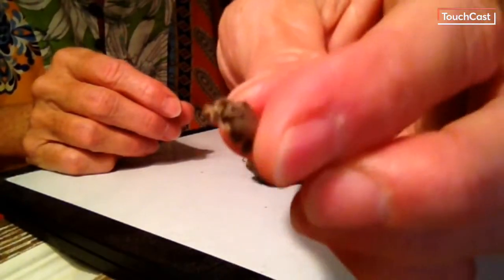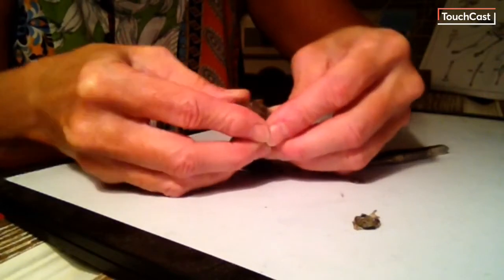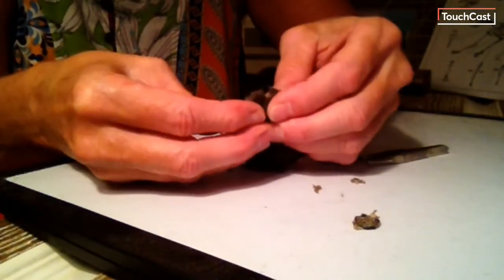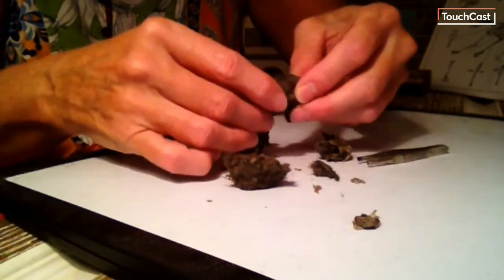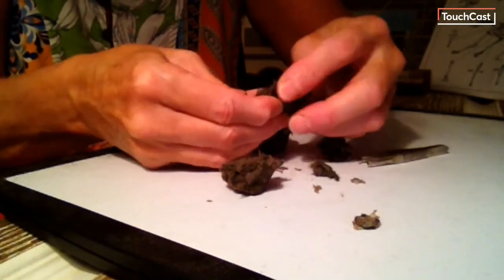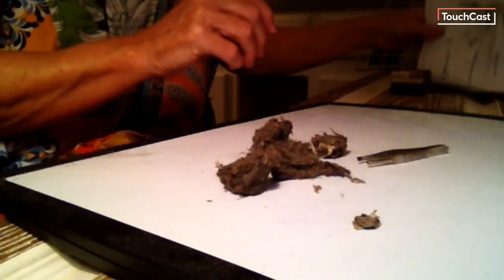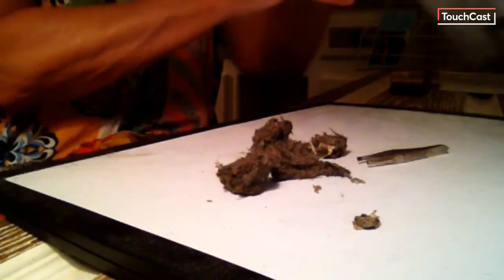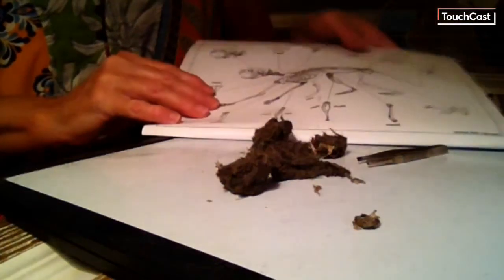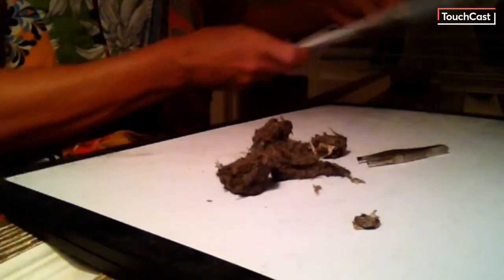You can start to see different parts of bones and fur — we've got little pieces of bones. With these owl pellets that I ordered from an owl pellet company, these are barn owl pellets. And they send an information sheet so that you can actually sort out the bones.